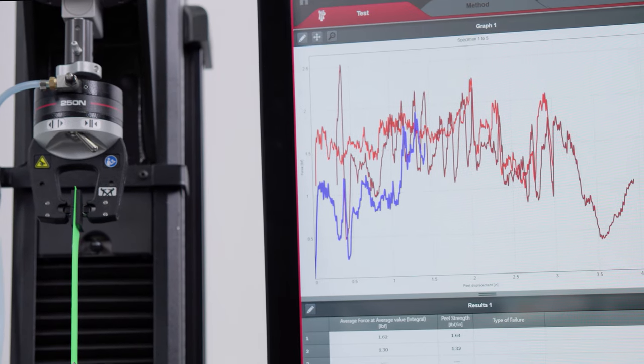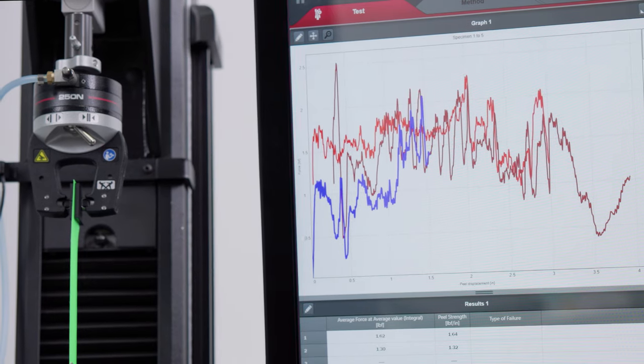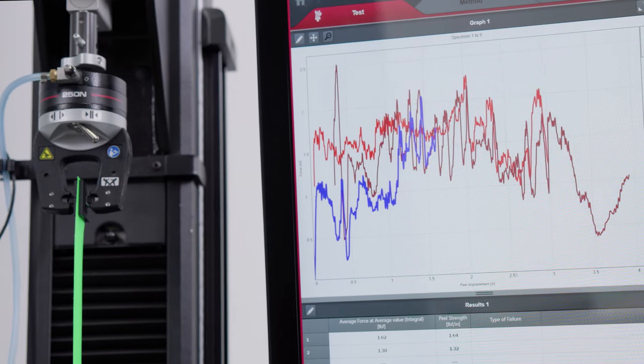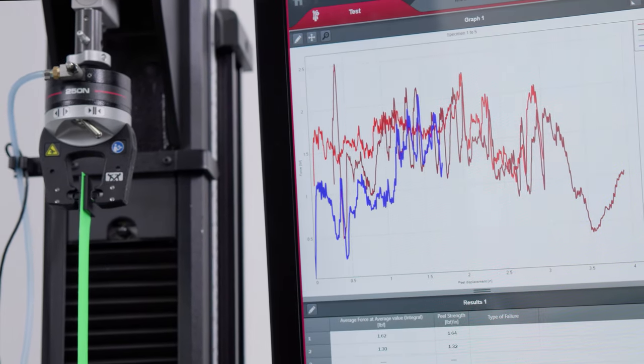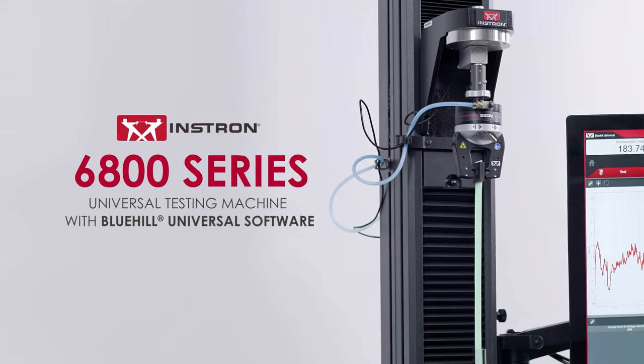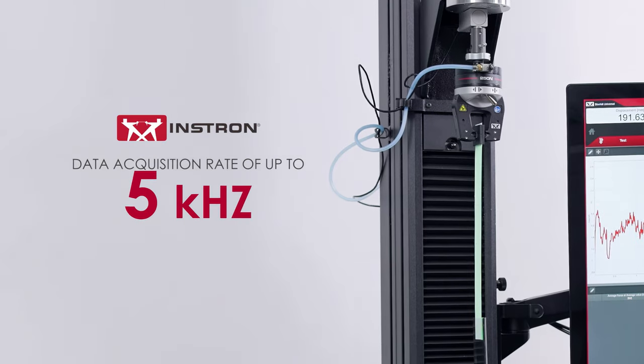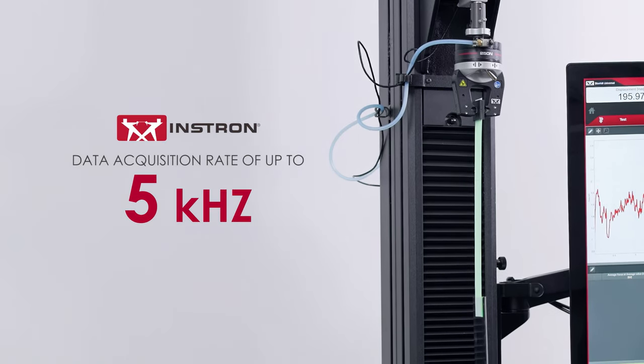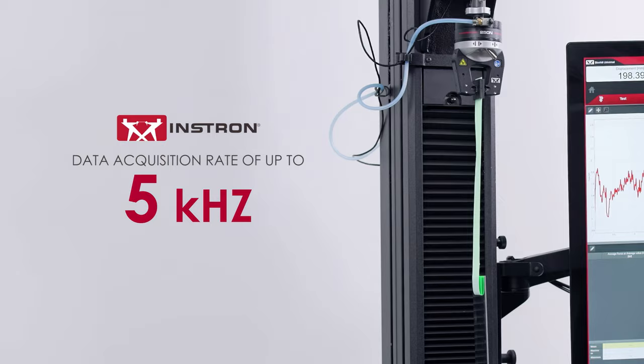Data from peel testing is prone to peaks and troughs and requires a test system with a high data acquisition rate to ensure that accurate peel adhesion values are obtained. INSTRON 6800 series systems with Bluehill Universal have a data acquisition rate of up to 5 kHz to capture every test event.